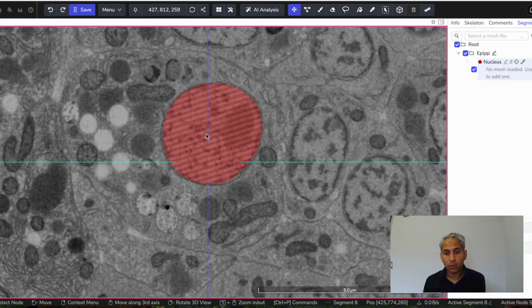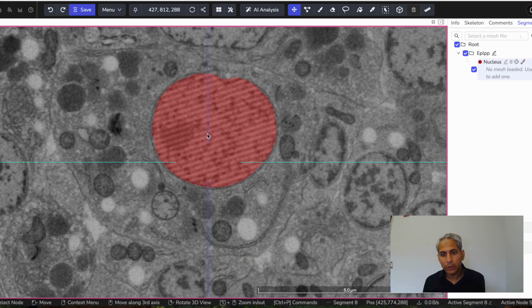Before I get to the annotation, I want to mention something. I noticed when I was annotating my nucleus, this feature. It seems like there's an indentation in my nucleus, and then there's this white, I don't know if it's a biocondensate or a membrane-bound membrane compartment.